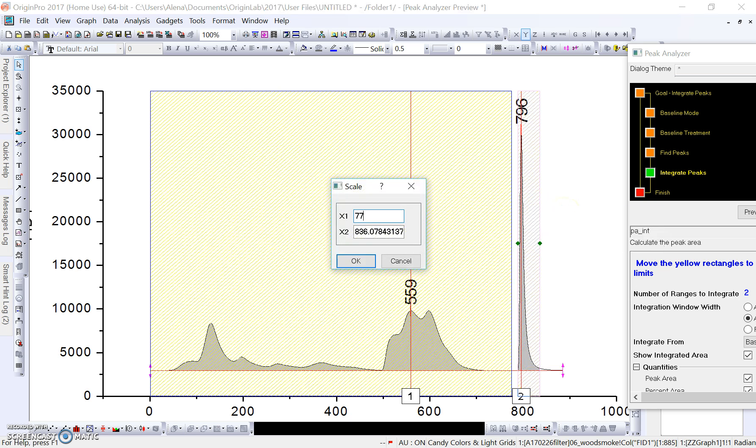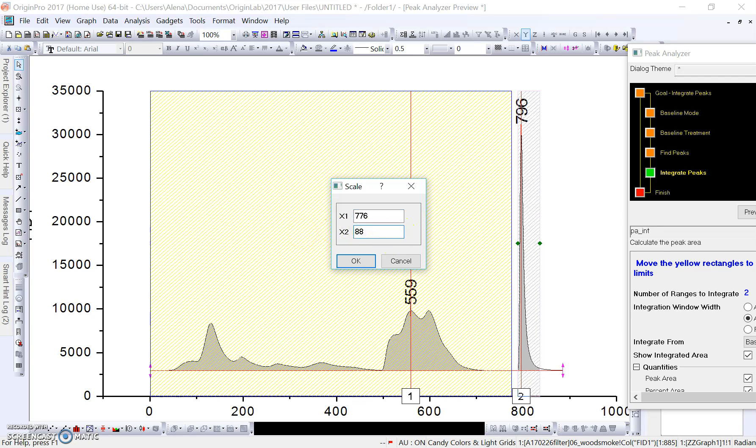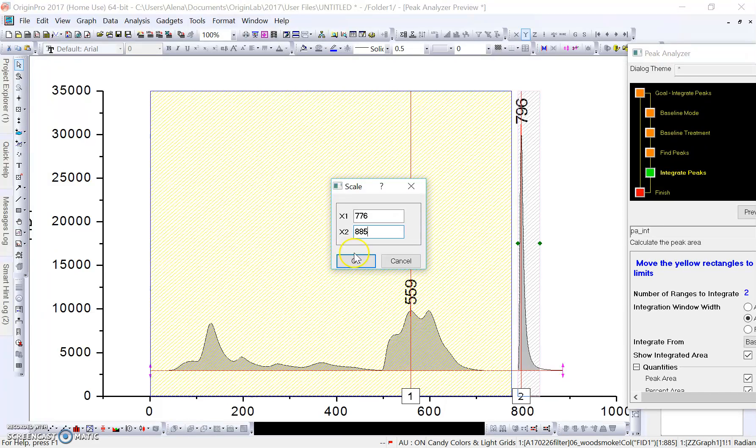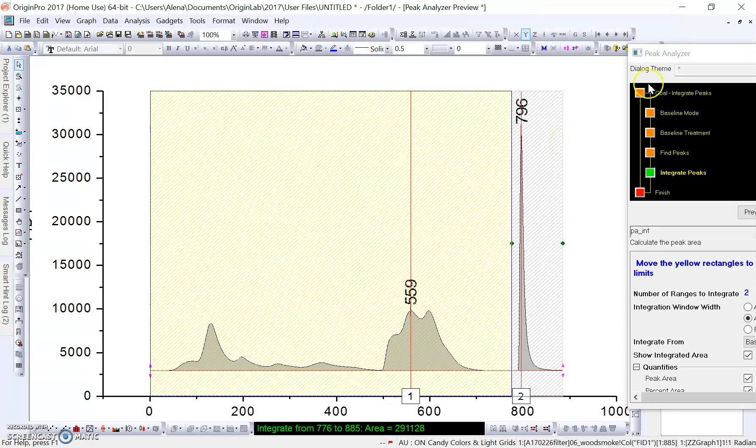I'm also going to right-click on this scale area. I'm going to set this to 776 because this is the beginning of our calibration peak phase. Then I'm going to end it at 885 because that's the time in seconds that our instrumental parameters are set at so that the run ends at 885 seconds. We're going to click OK here.